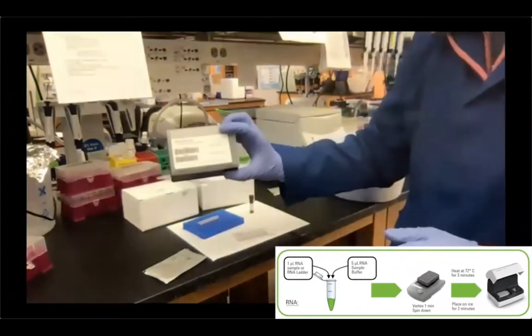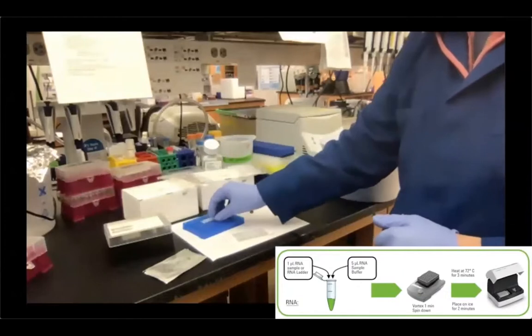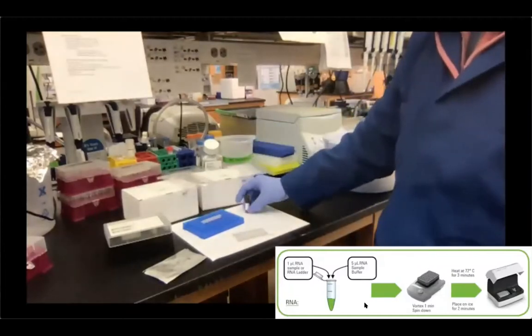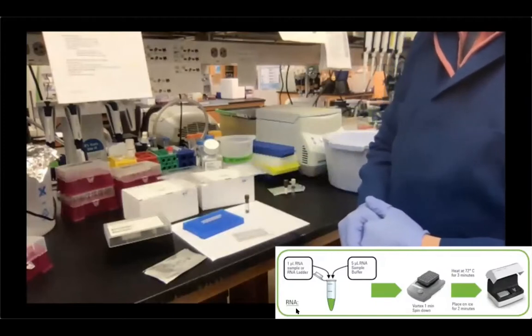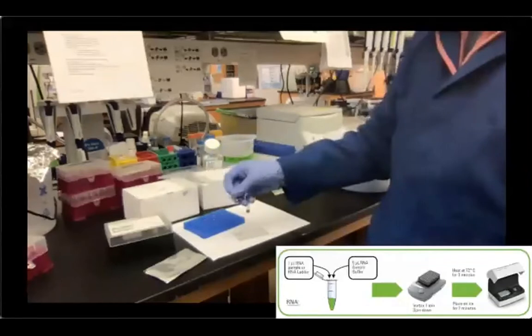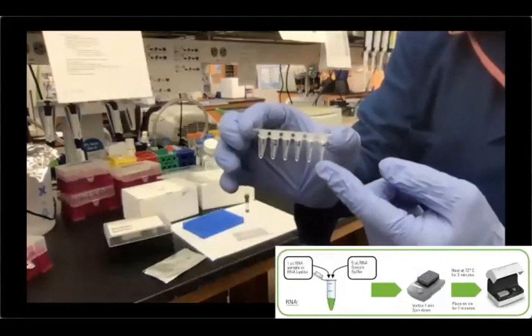And I have the tips for loading on the machine. And so we are basically ready to go. I've allocated 1 microliter of my RNA samples in here, and also 5 microliters of the sample buffer. That's what the RNA regular sensitivity protocol requires, okay? I actually have only five RNA samples. However, as you can see, I also have a 6th sample here, okay?